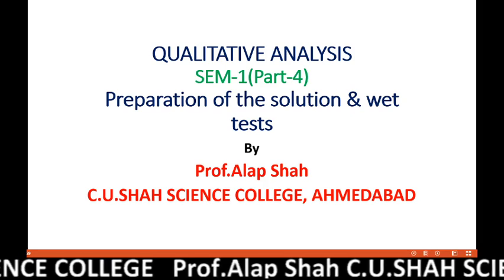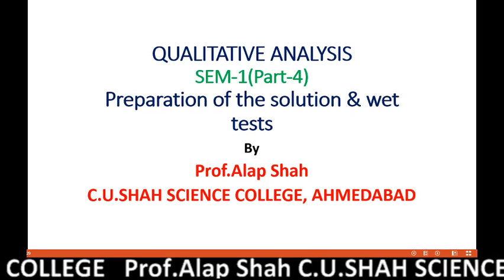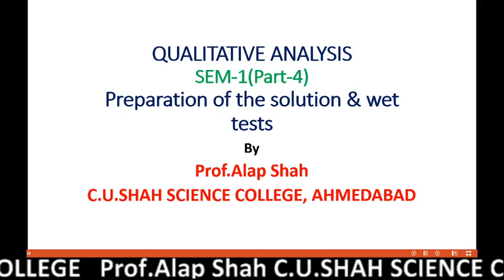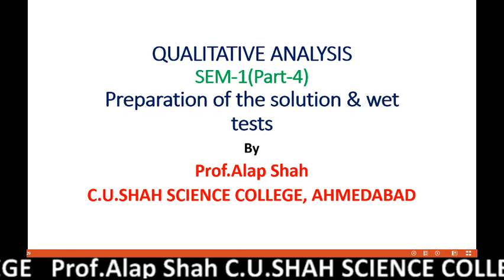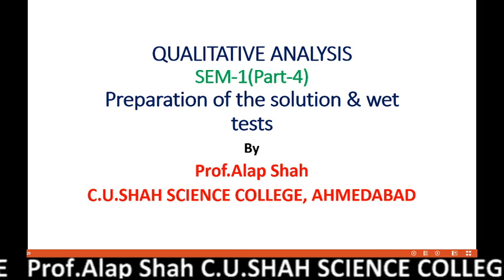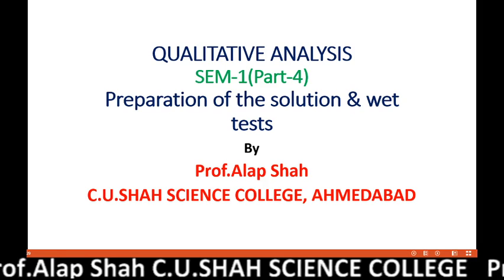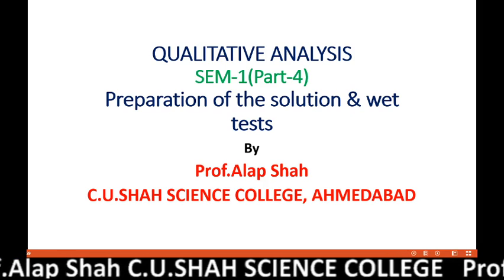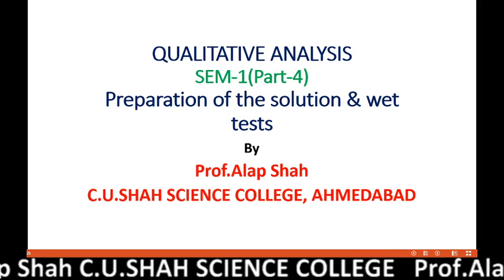So in this fourth part, first we will discuss the preparation of the solution. That is again new, because you are given a ready-made solution in the 12th standard. And today, in the second part, we will discuss the wet test. That is actually a repetition of the 12th.